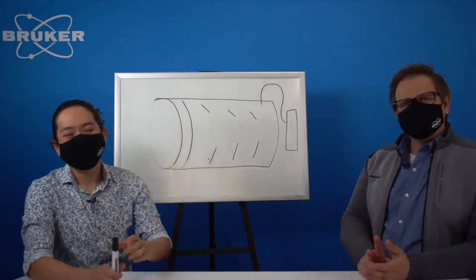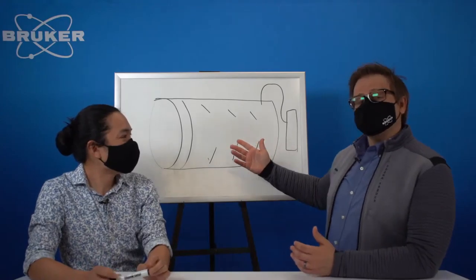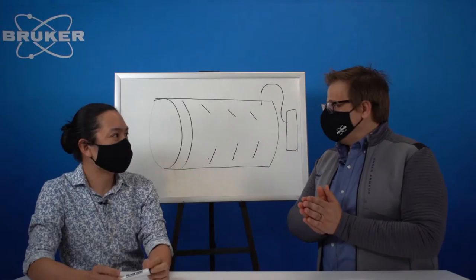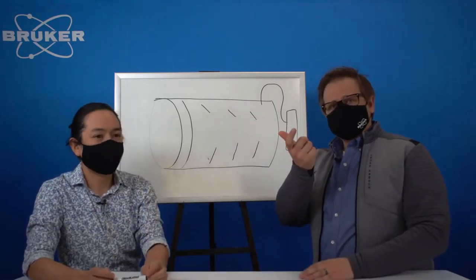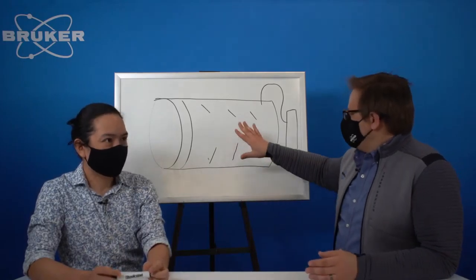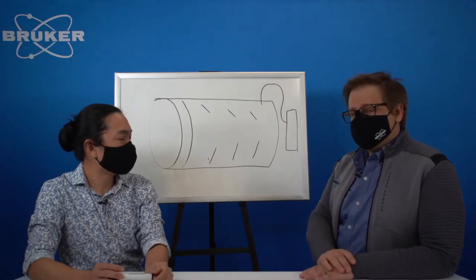So that's kind of what you did. And sometimes people would also limit their analysis to a very narrow region. There are some methods like respirable silica, where it's like a degree. You just measure a peak. One peak, and you base all of your conclusions on that, because you had to use that graphite monochromator, which reduces the signal, and you're looking for very, very tiny signals too.